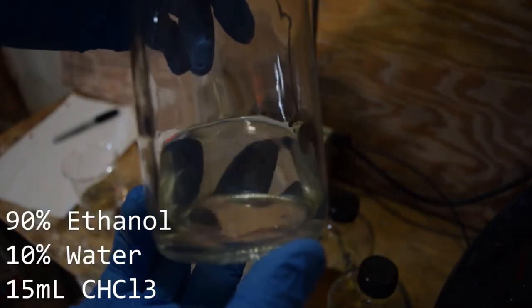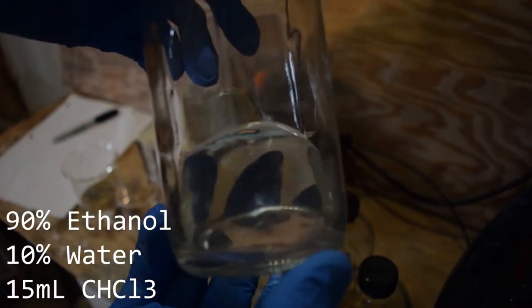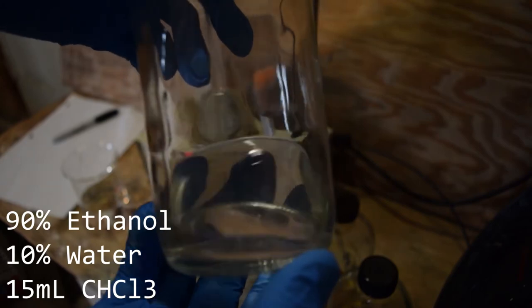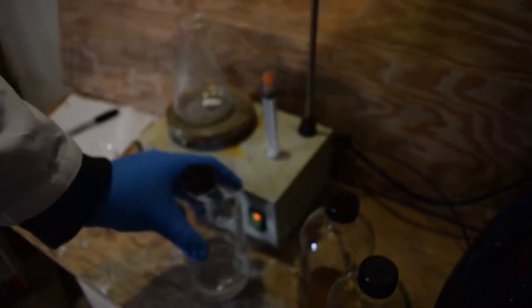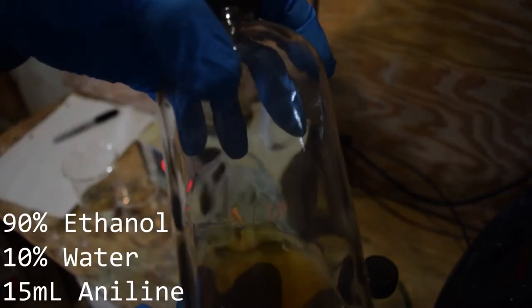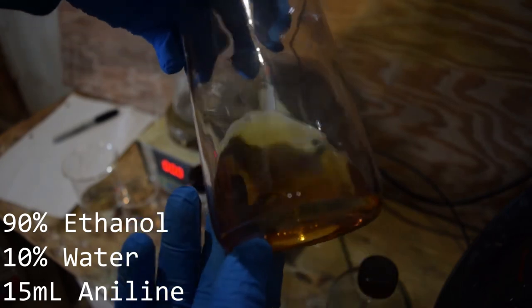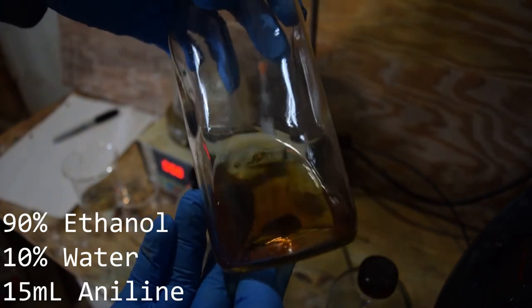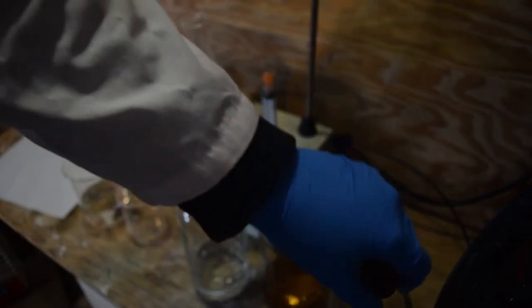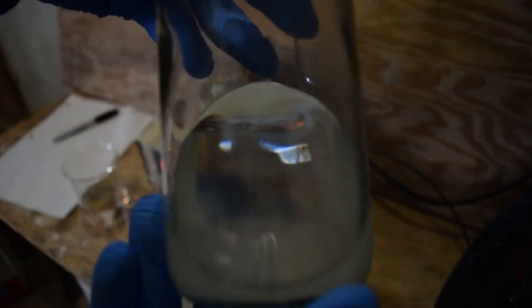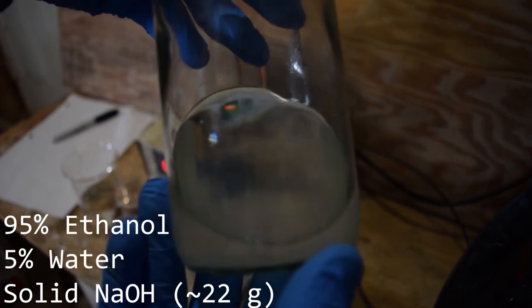This is a mixture which is in a 90:10 proportion of ethanol to water which has 15 milliliters of chloroform or trichloromethane dissolved in it. This is the same type of 90:10 mixture of ethanol and water but has 15 milliliters of aniline or aminobenzene dissolved in it. And finally, the solution of sodium hydroxide in ethanol.